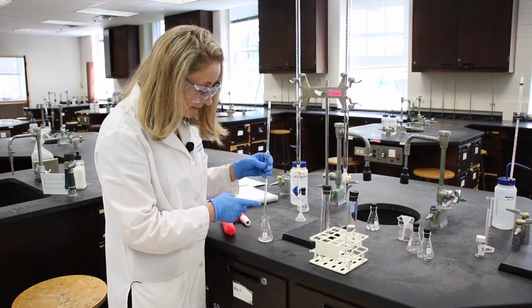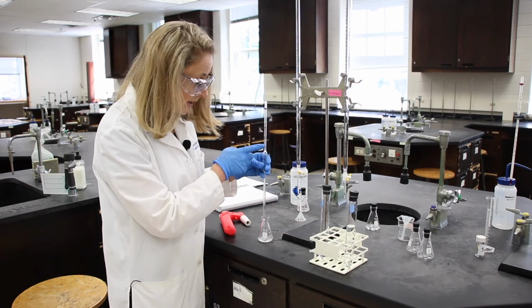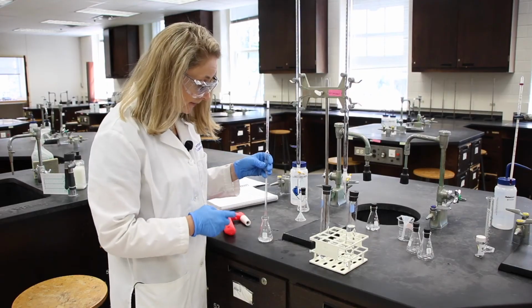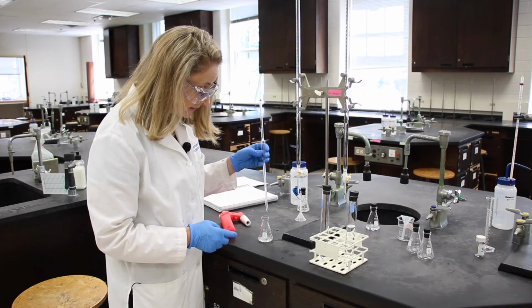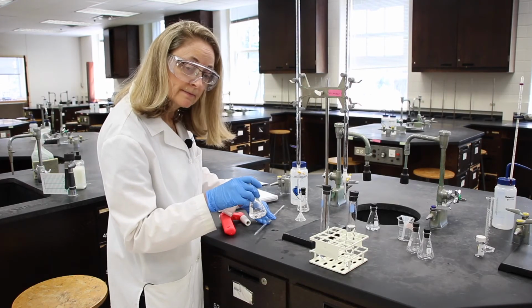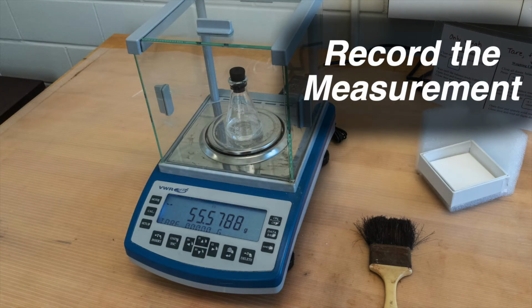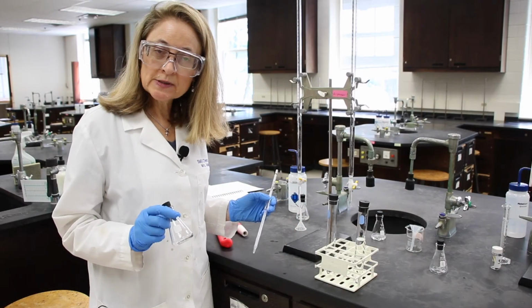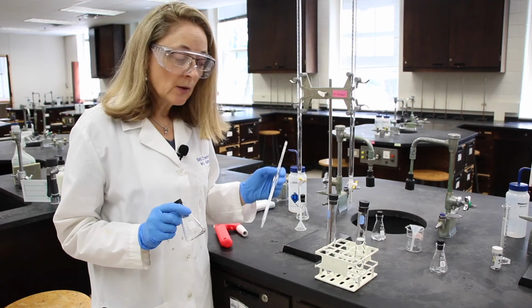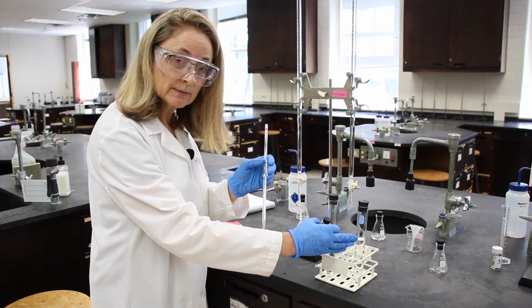You may see a little bit of liquid still in the pipette when you're done. These pipettes are calibrated to deliver, so that is okay if you see a little bit in the pipette. Now let's weigh this. We'll now repeat the same procedure for the 2-propanol, and we'll make sure that we normalize the pipette again with our new number 2 solution.